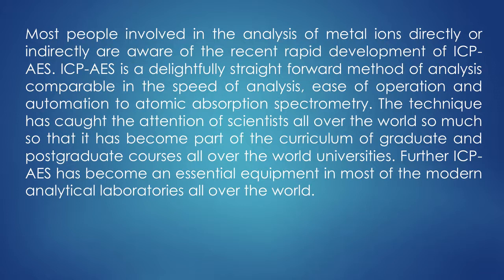The technique has got the attention of scientists all over the world, so much so that it has become part and parcel of graduate and postgraduate syllabi, and universities all over the world are teaching it. At the same time, any established laboratory engaged in the analysis of metal ions must have atomic absorption and ICP-AES as essential equipment in most modern analytical laboratories all over the world.